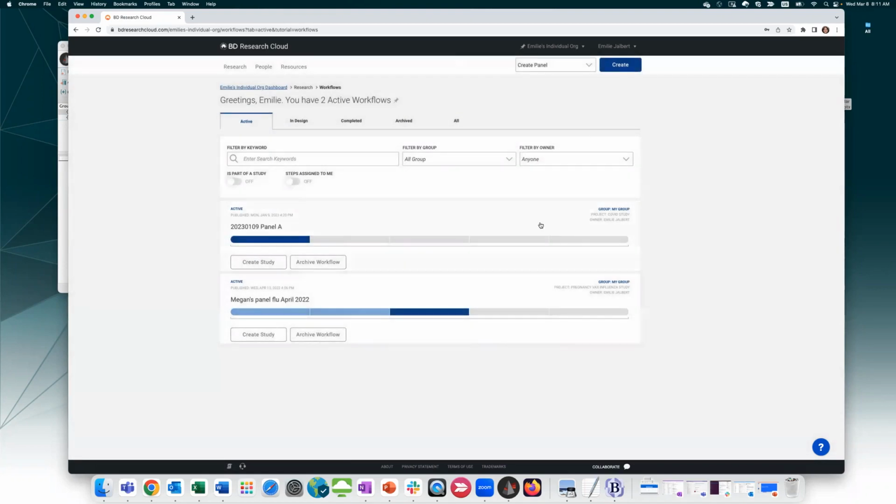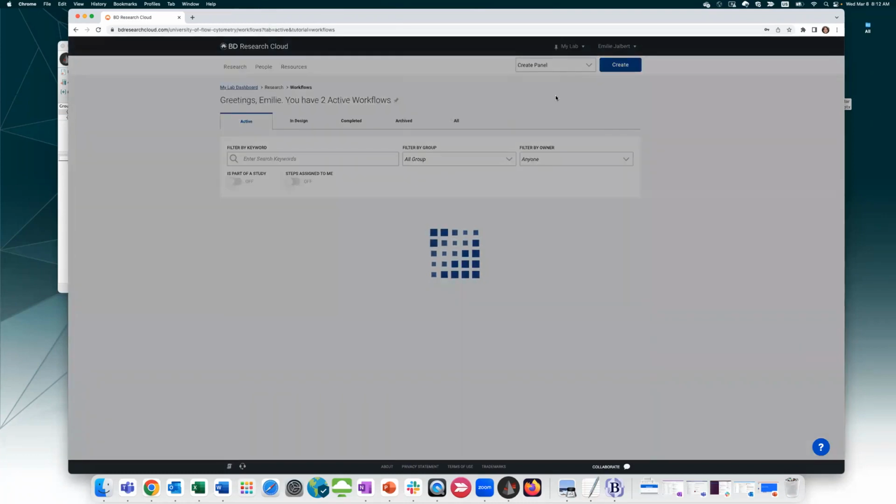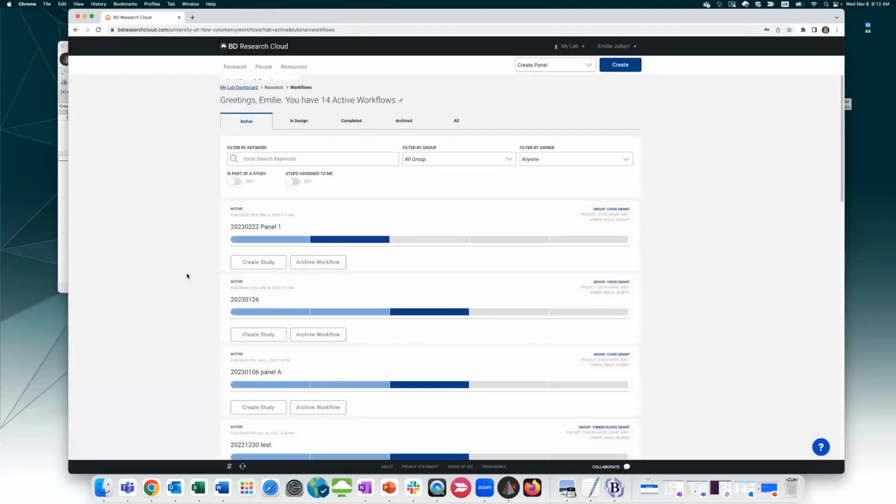So then once you've created your free organization, it will show up in your drop-down list. I have many organizations, but typically you would only have your individual one and maybe one or two additional shared or collaborative organizations. So once you're in your collaborative organization, the next step I recommend is to create your groups and projects, because when you invite people, you'll have to assign them to a group or a project. To do so, you just go over here to people, groups, and projects.